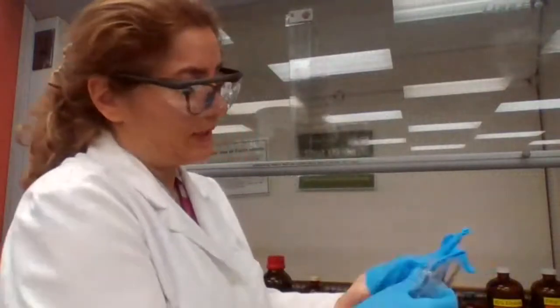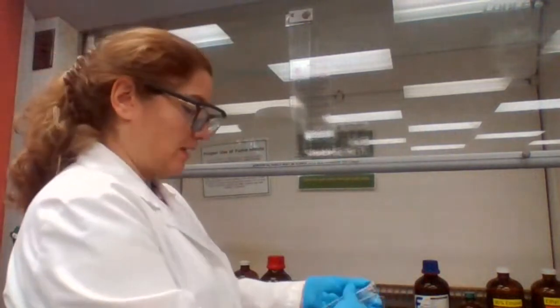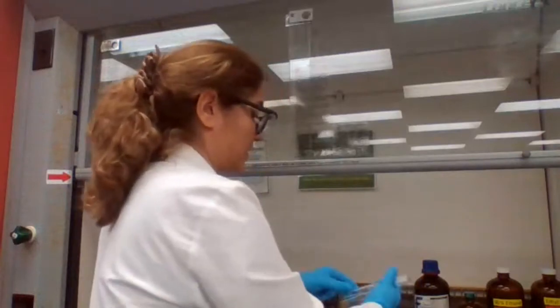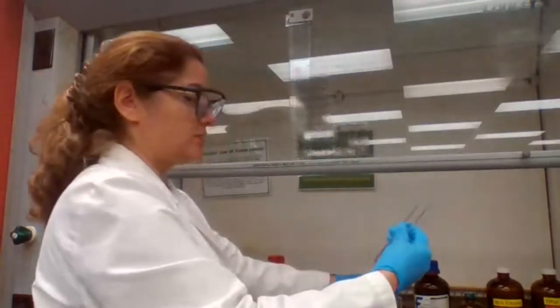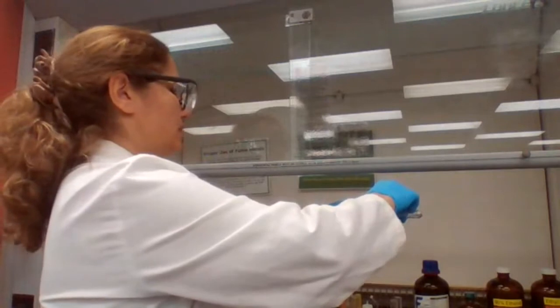Silver nitrate can stain your skin, and if it does stain, you can't wash it off. It will stay there for 2-3 weeks until the skin is peeled off. So if you're working with silver nitrate, you have to be very careful so it doesn't contact your skin. So I'm going to divide this into 3.